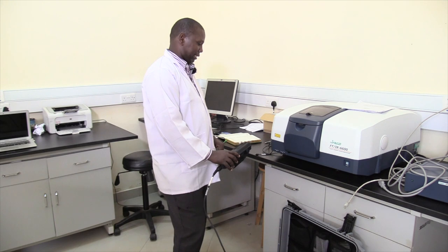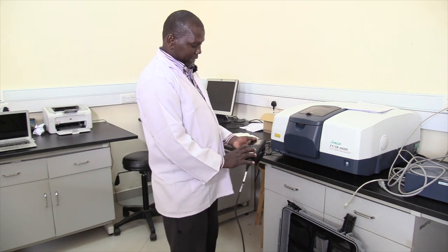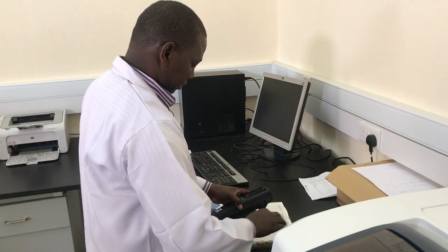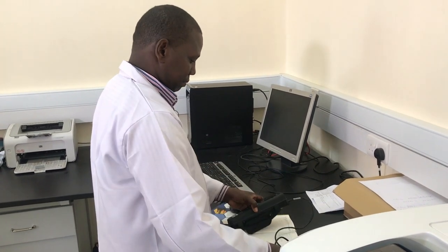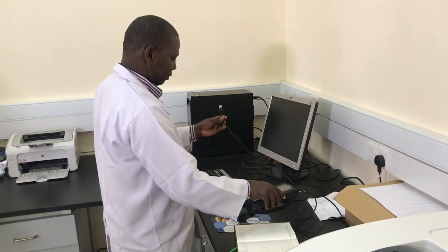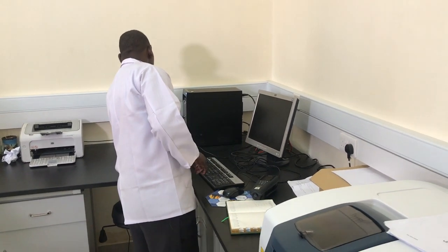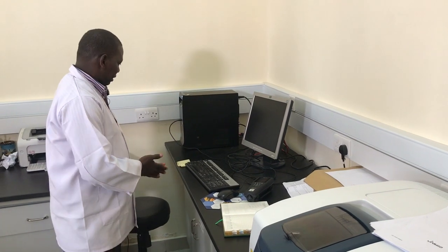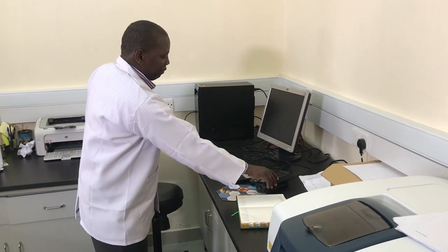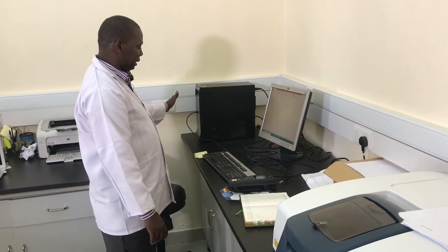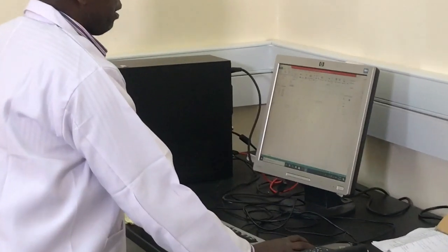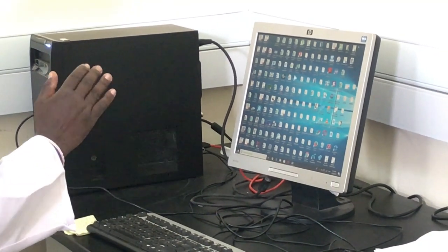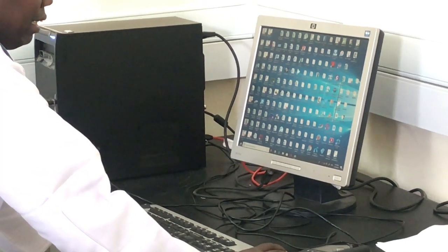We disconnect the computer part from the sonde and connect it to the PC. For the first step we connect the computer part to the PC, then we open the KorDSS program that has been installed on our PC.